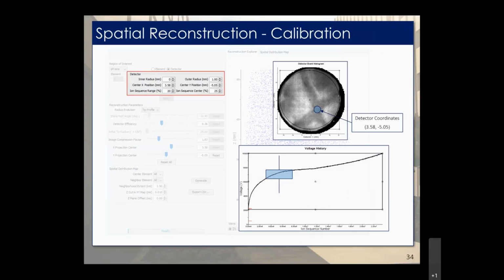So we can take this small amount of data, and then build the reconstruction projected from, or centered on, that point. What this does is set up our Z to be equal to the direction of that pole, such that we can expect the planes to be normal to our Z axis.